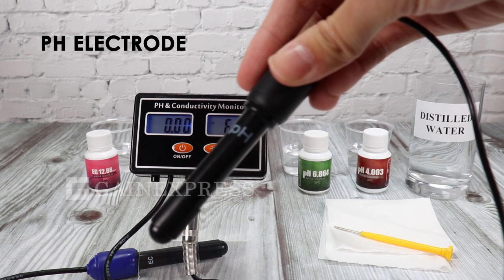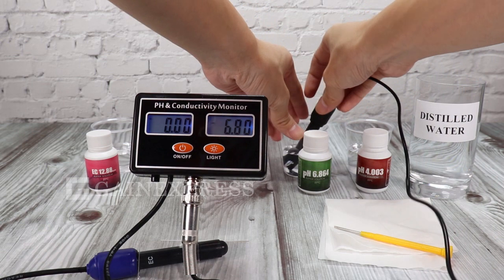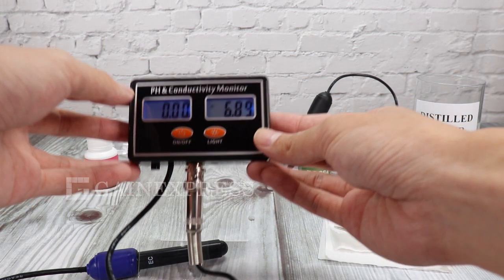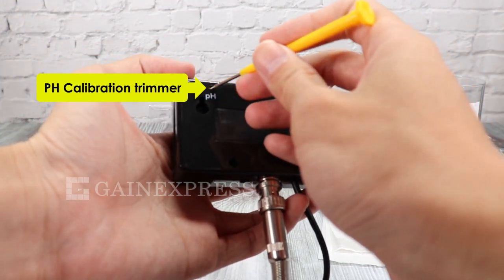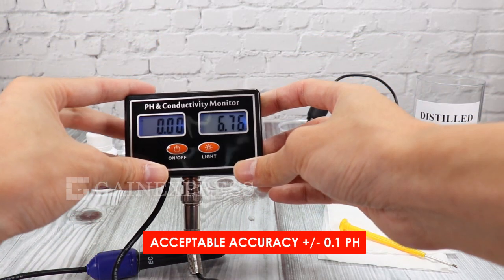To calibrate the meter, immerse the pH electrode first into the pH 6.86 solution. Gently turn the pH calibration trimmer using the mini screwdriver provided in the set, until 6.86 shows on the display. It is acceptable if the display value is within the error range.